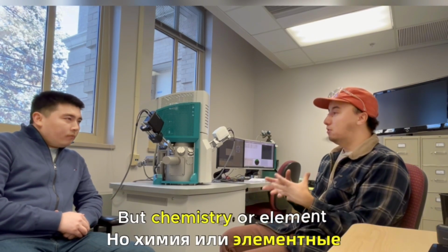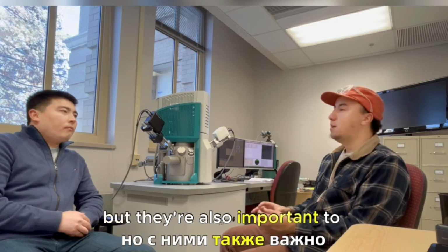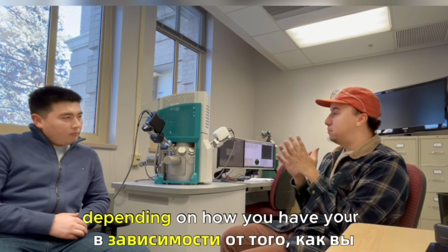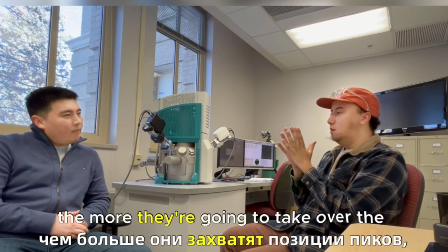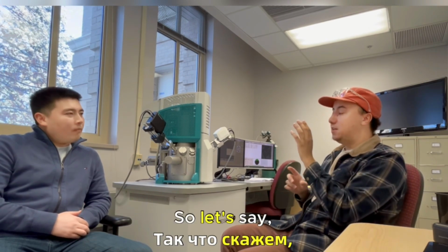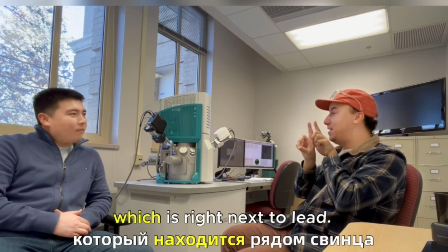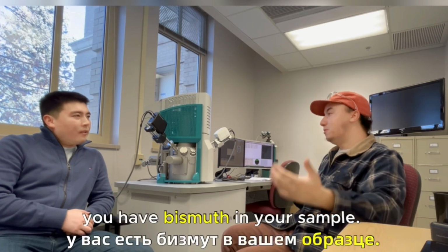But chemistry or element maps with EDS are really interesting and can produce some very cool data, but they're also important to be careful with, because in that spectra, like I showed you, those peaks can be fairly broad depending on how you have your detectors set up. The broader those peaks are, the more they're going to take over the positions of peaks next to them. Let's say lead and sulfur, where peaks are right on top of each other, and then you have bismuth, which is right next to lead. If your lead peak is fairly broad, it may start to look like you have bismuth in your sample.